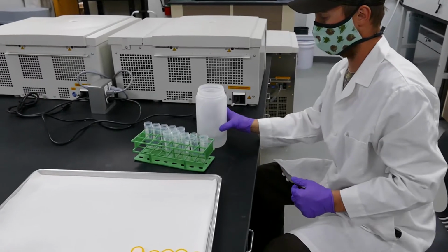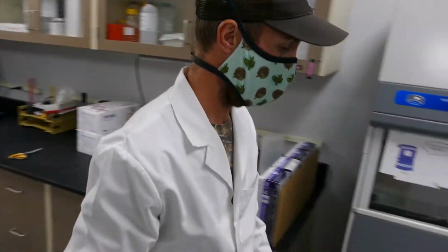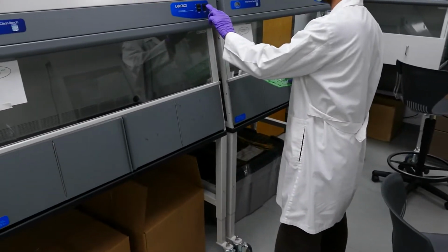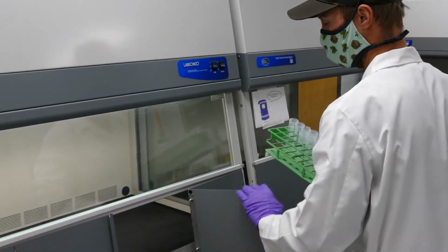The samples are now ready to be dried. Place the open tubes in the laminar flow hood and turn on the airflow until all traces of ethanol or isopropanol smell are gone. This process typically takes 24 hours from when the last tubes are placed in the drying hood and should never take more than 48 hours.